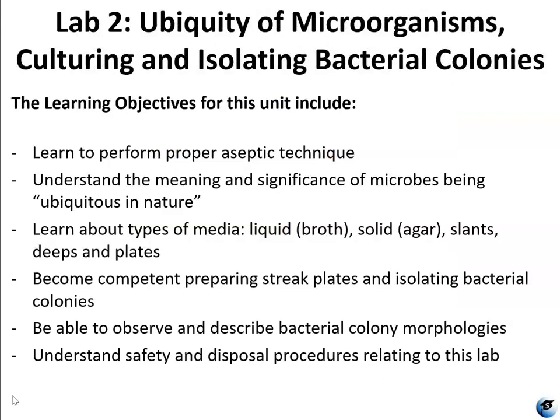The learning objectives for this unit include learning to perform proper aseptic technique, understanding the meaning and significance of microbes being ubiquitous in nature, learning about the types of media: liquid broths, solid agars, slants, deeps, and plates, and becoming competent preparing streak plates and isolating bacterial colonies, being able to observe and describe bacterial colony morphologies, and, of course, as always, understanding safety and disposal procedures relating to this lab.